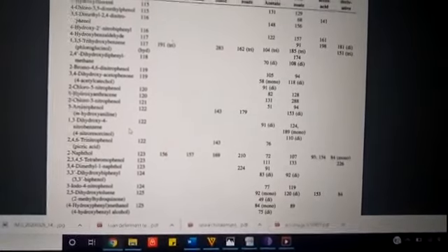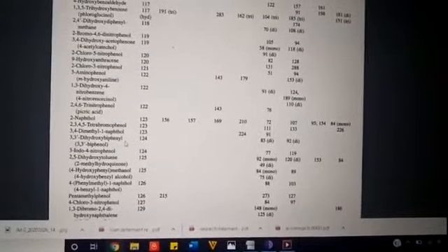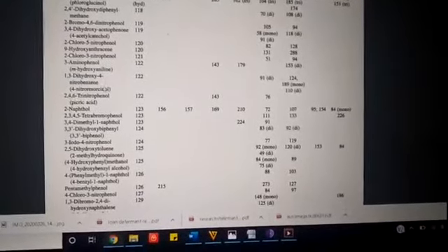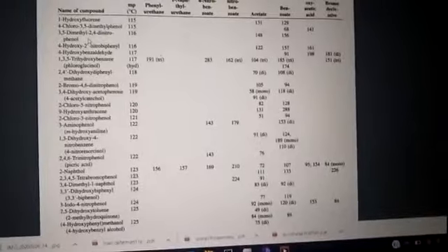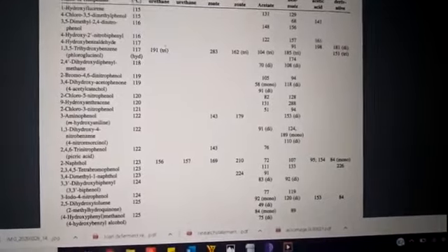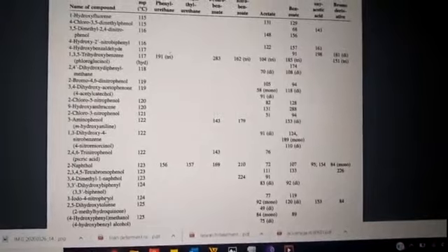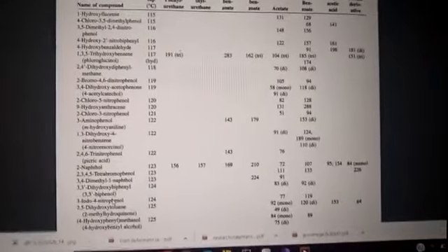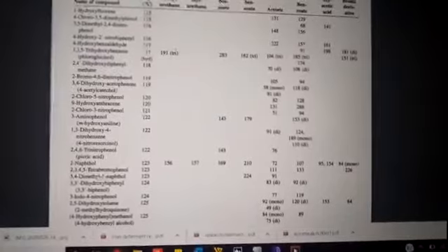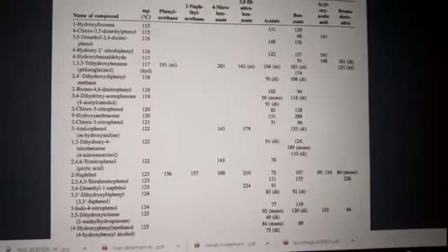If you err on the side of caution, you'll look at things that are plus or minus 5 or 10 degrees. If you've got it narrowed down to, let's say, all of the compounds in 115 to 125, you would just have to deduce with your spectra which ones would make sense given the spectra that you have and the signals that you would expect to see.